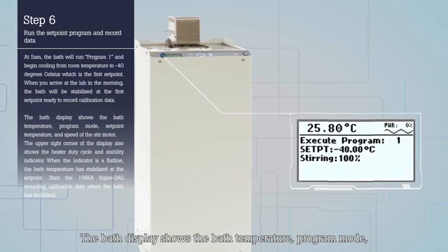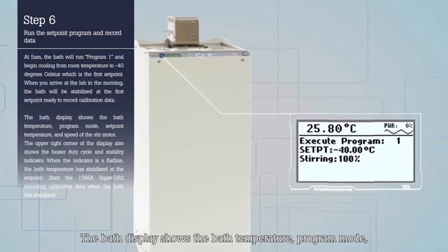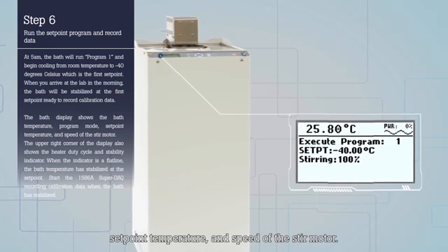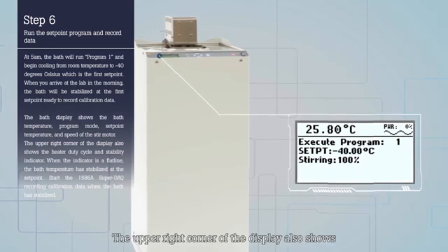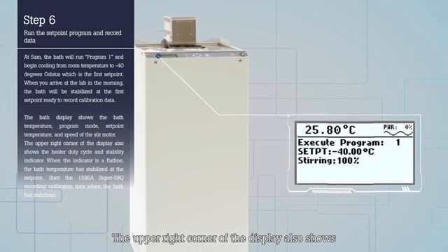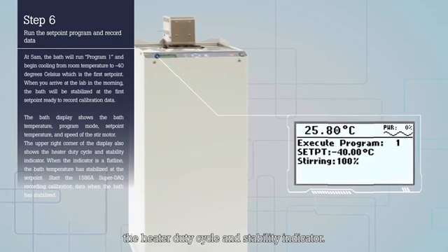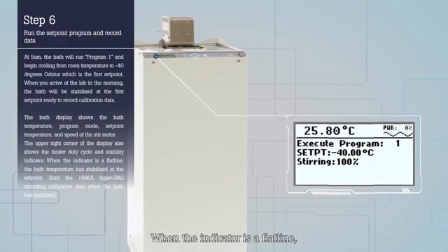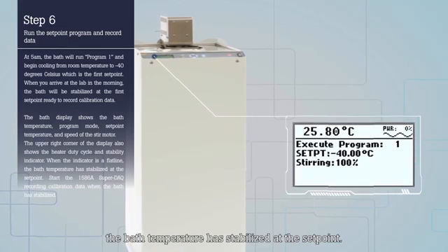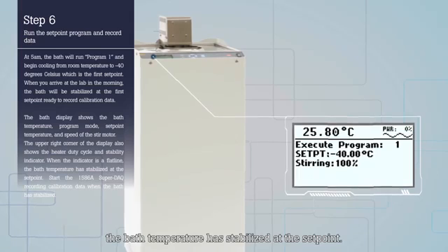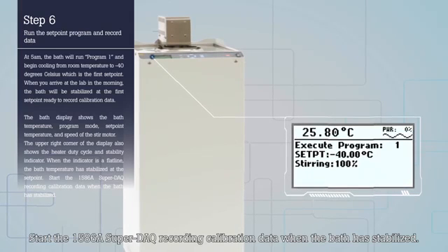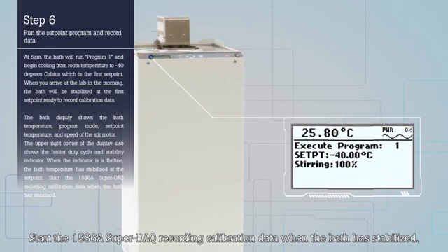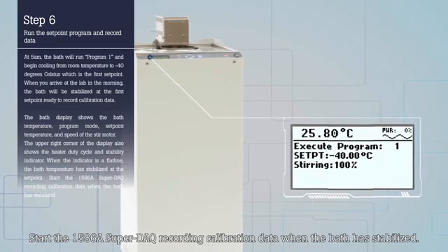The bath display shows the bath temperature, program mode, set point temperature and speed of the stir motor. The upper right corner of the display also shows the heater duty cycle and stability indicator. When the indicator is a flat line, the bath temperature has stabilized at the set point. Start the 1586A Super-DAQ recording calibration data when the bath has stabilized.